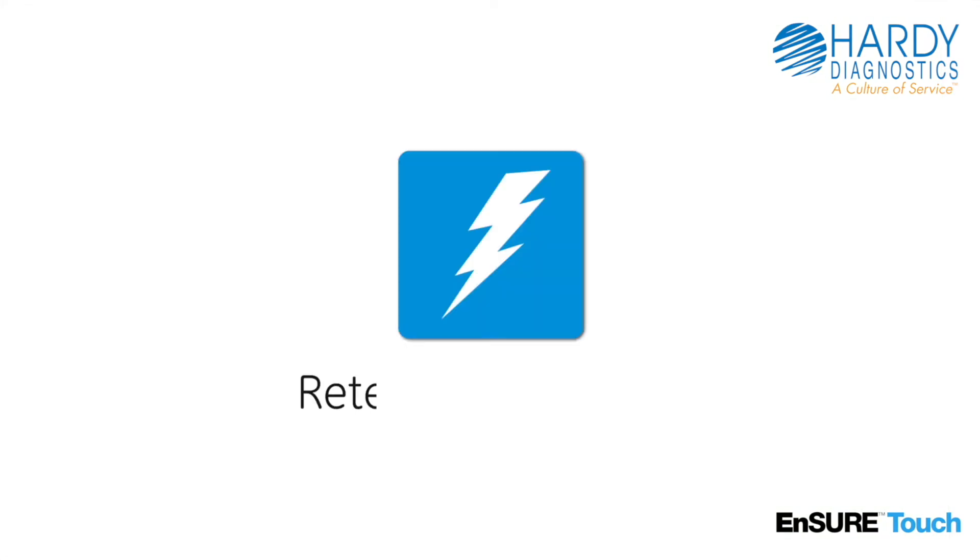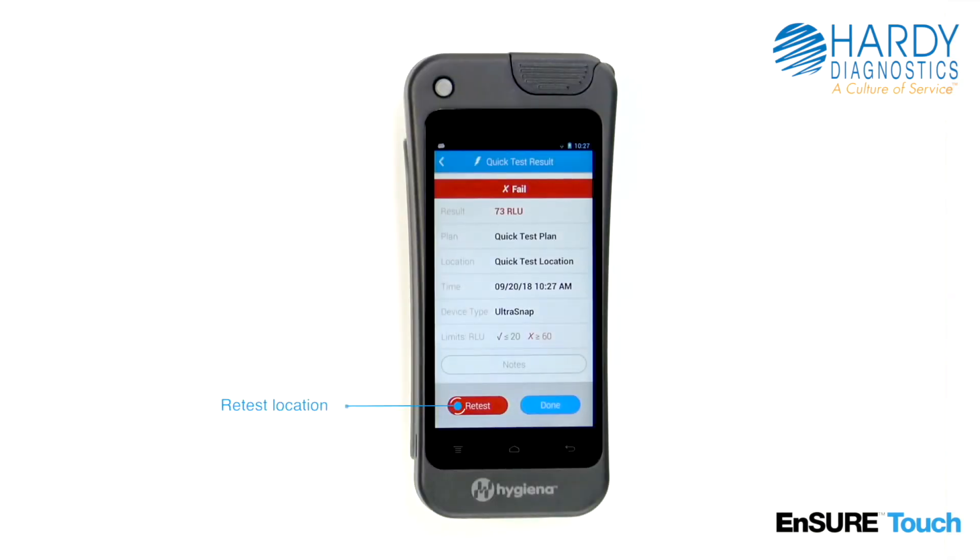When a test does not pass, a corrective action such as recleaning should be performed. After, it's important to retest the location and keep a record of the retest result. From the results screen, simply touch the retest button.